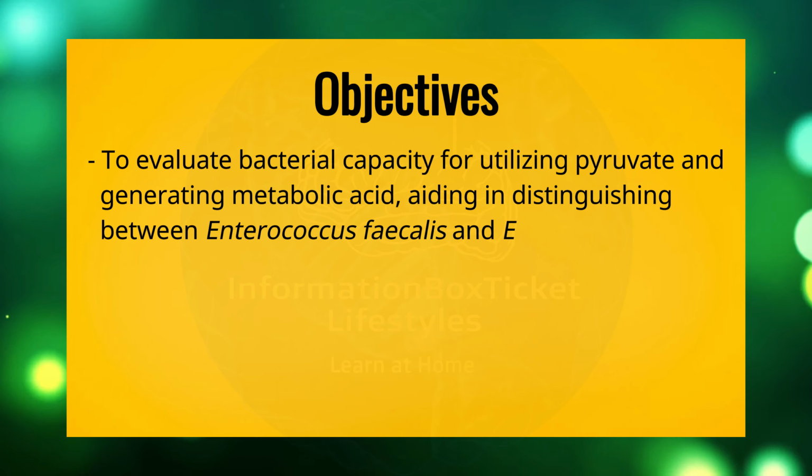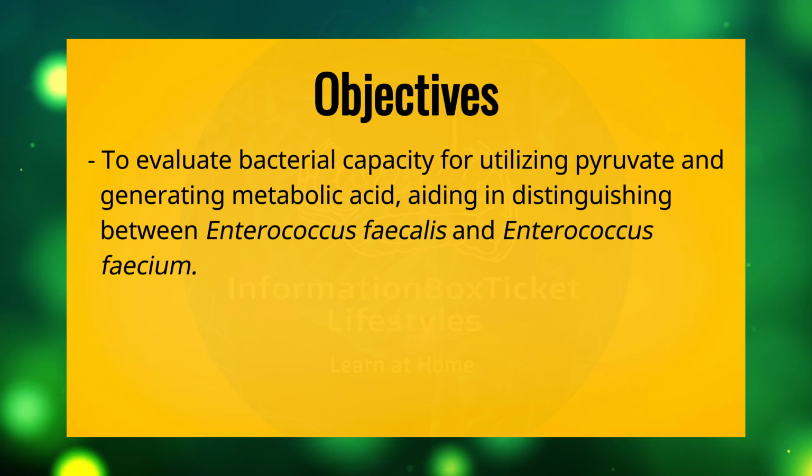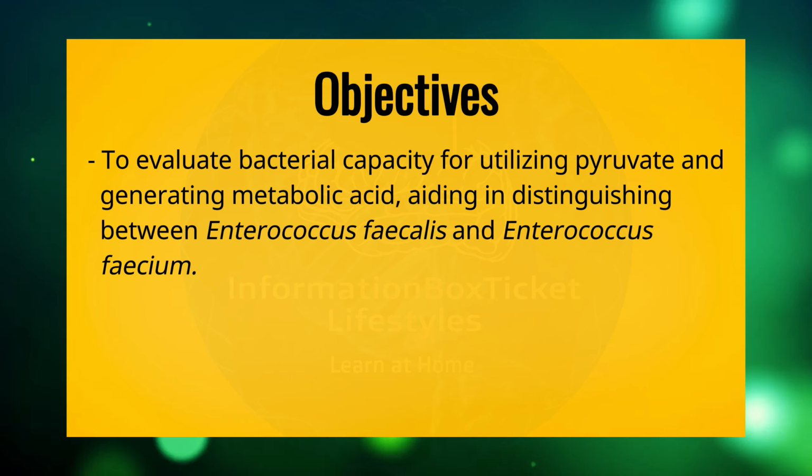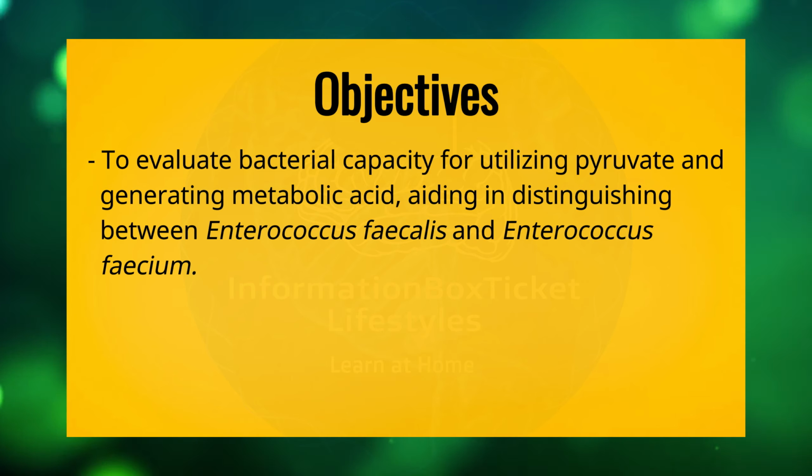Objectives. To evaluate bacterial capacity for utilizing pyruvate and generating metabolic acid, aiding in distinguishing between Enterococcus faecalis and Enterococcus faecium.